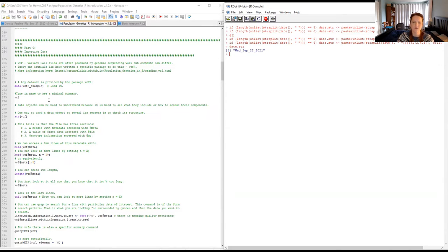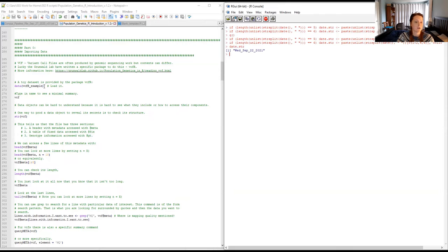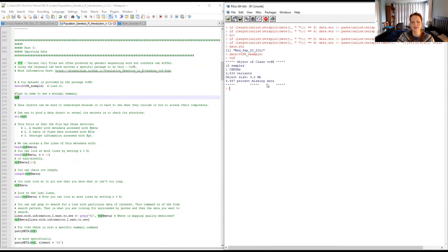One type of file frequently produced by genomic pipelines is a variant call file (VCF). The contents of a VCF will differ from place to place, which makes it a little difficult to get into R. Luckily, the Grunwald Lab has produced a package called vcfR to help with that. To use it, we simply load their example data. It tells us: 18 samples, one chromosome or contig, this many variants, and 8.5% missing data overall. So it brought the data in — that's a good sign.